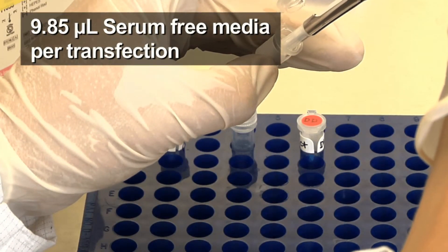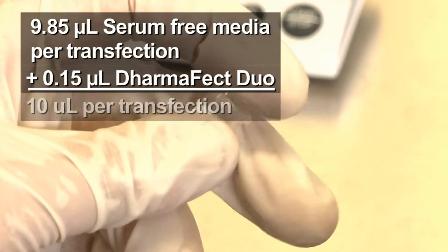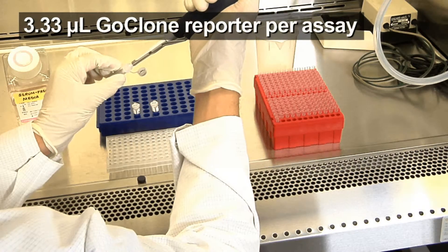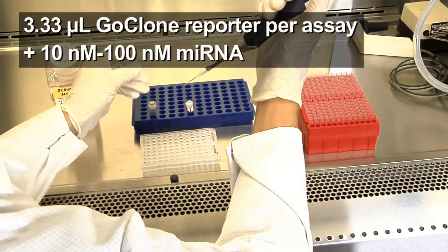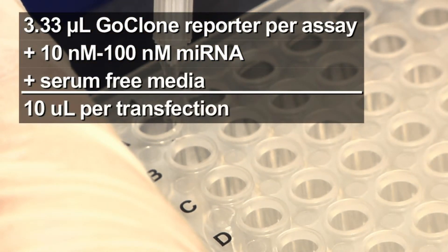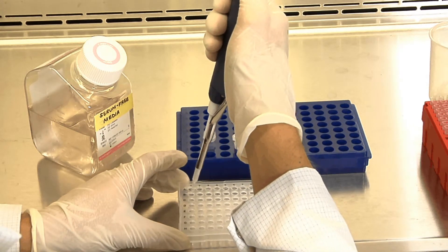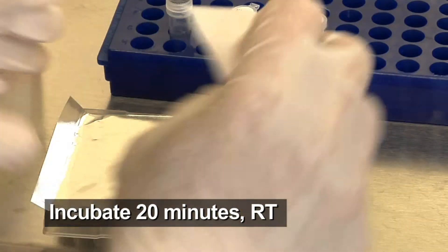Create the transfection-reagent mixture by combining 9.85 microliters of serum-free media and 0.15 microliters of Dharmafect Duo per transfection. Allow the mixture to incubate at room temperature for 5 minutes. Then, create the DNA-RNA mixture for each assay by combining 3.33 microliters of the go-clone reporter construct with enough microRNA mimic to achieve the desired final concentration. Bring the volume to 10 microliters with serum-free media. Next, combine 10 microliters of the transfection-reagent mixture with 10 microliters of each DNA-RNA mixture and mix well, for a final volume of 20 microliters per assay well. Cover and incubate for 20 minutes at room temperature.